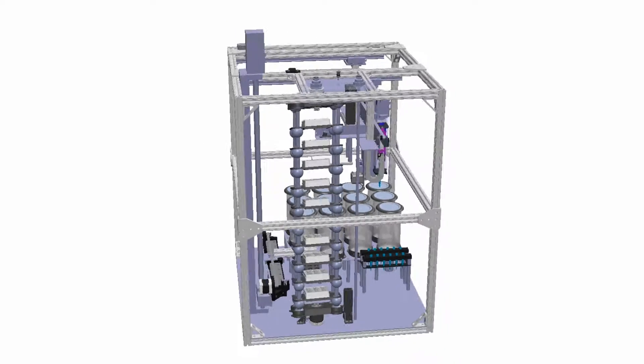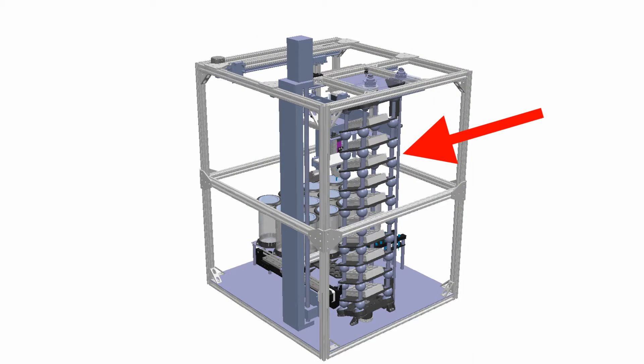Let's look at the different subsystems. The nutating tower contains 10 well plates with 12 experiments each, for a total of 120 simultaneous experiments. It keeps 9 of the 10 well plates agitated while the 10th is being processed.